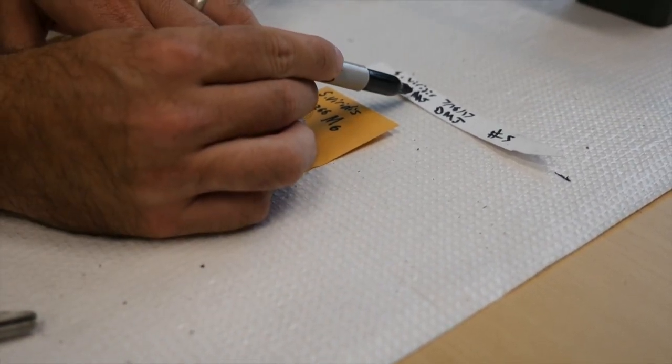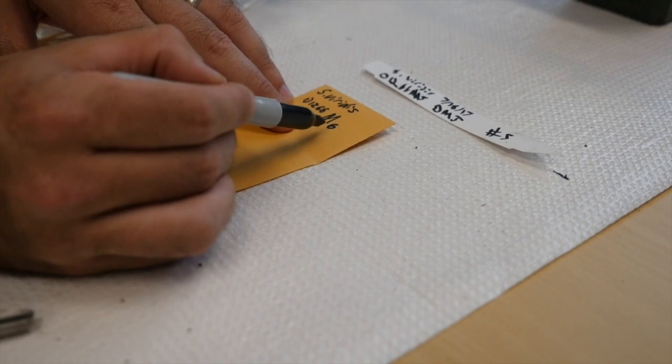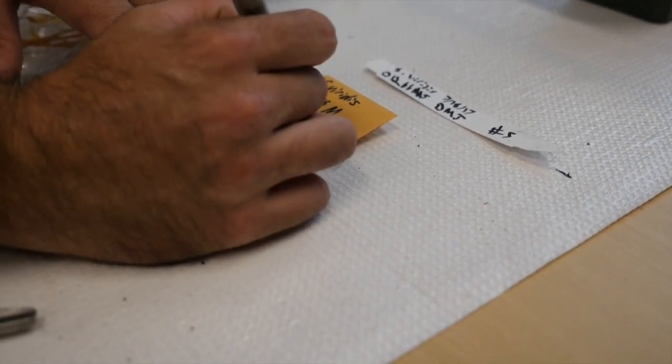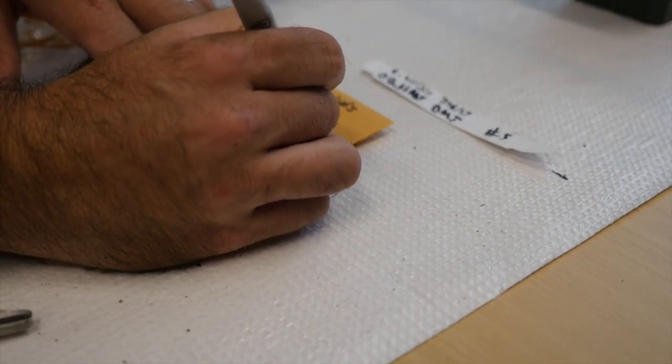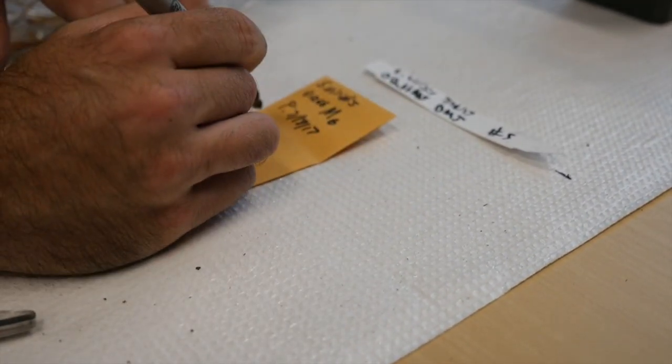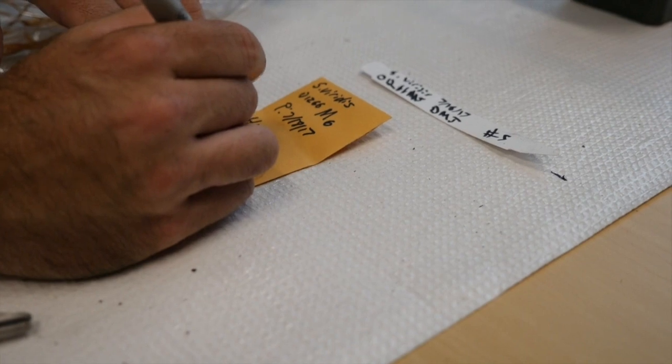And then plant date will be on the tag, and then today's date, the date in which it was harvested.